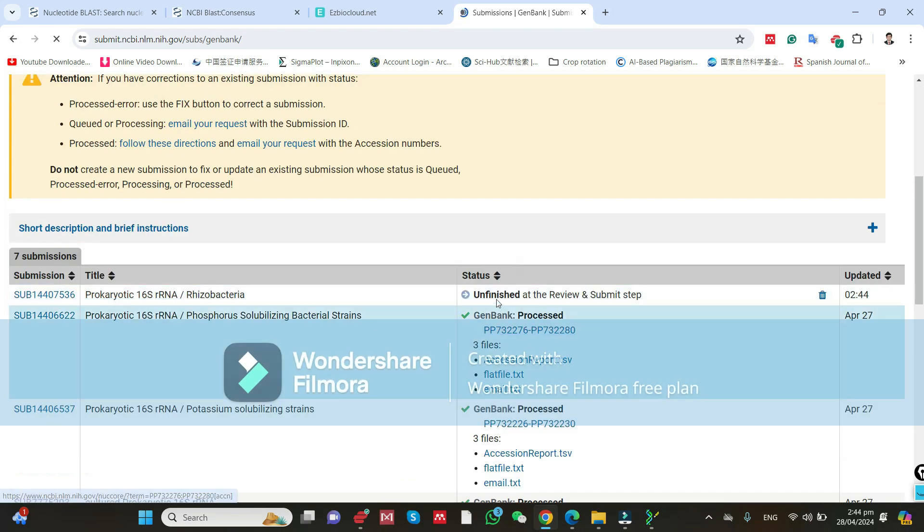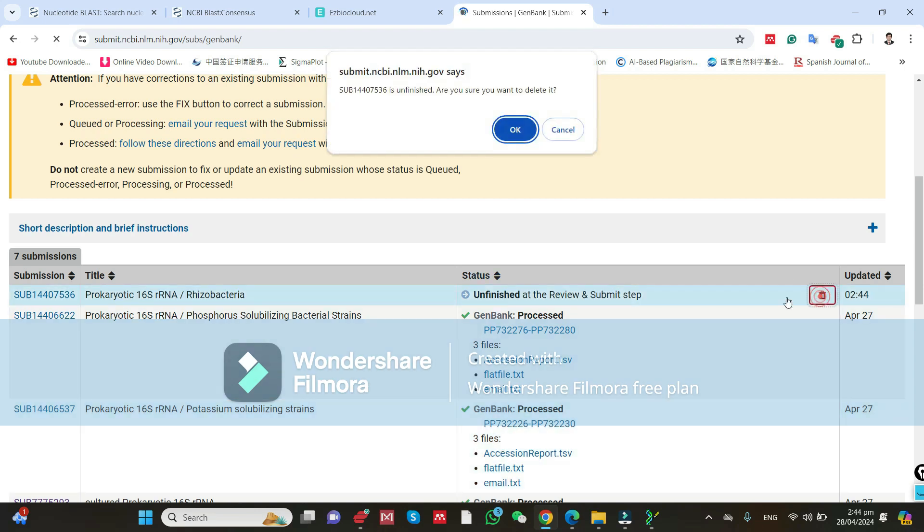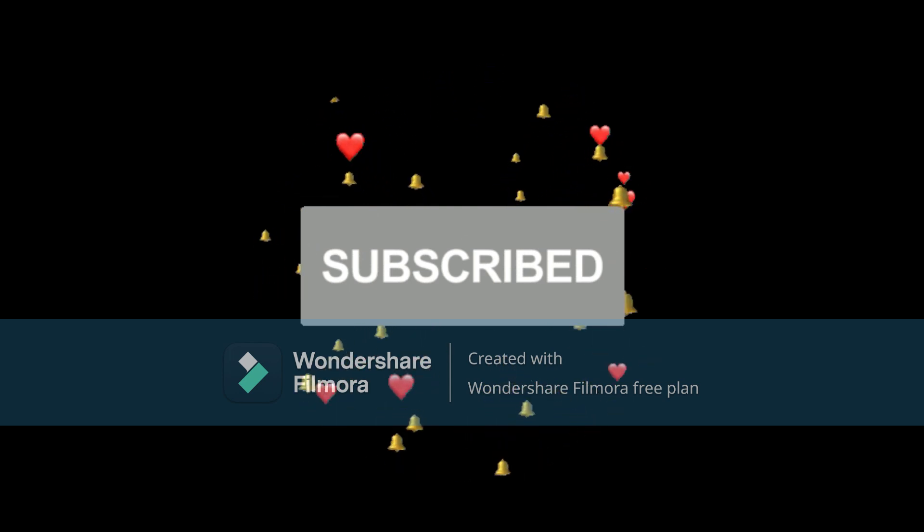I will go back to the submission portal. It will show as Unfinished. I will delete it because I have already published this strain. You can see the existing published submission here. Clicking on it will show more information and your list of submissions. Thank you.